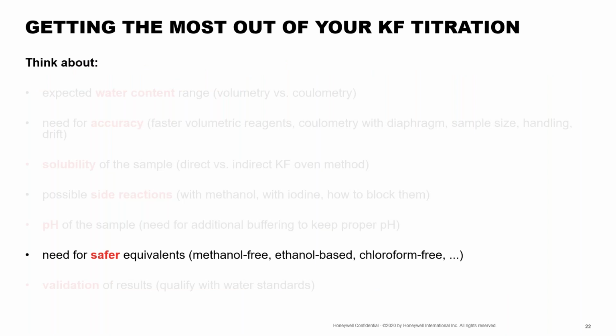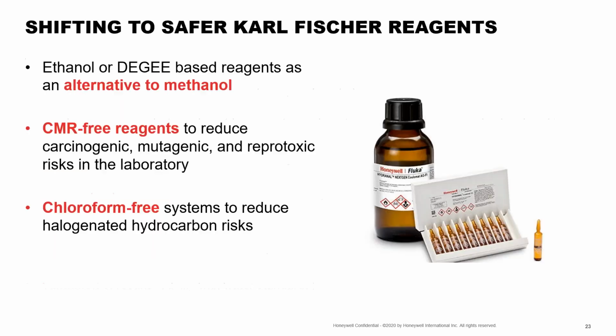Okay, last but not least, reagent category. We're going to spend a little bit of time talking about safer reagents. I think it's no secret that we always want to be making our work in the lab as safe as possible. If we have solutions available to us to shift to safer equivalents that don't impact the performance, I think we want to be considering those. So when we're talking about this, we're thinking about, if possible, alternatives to methanol.